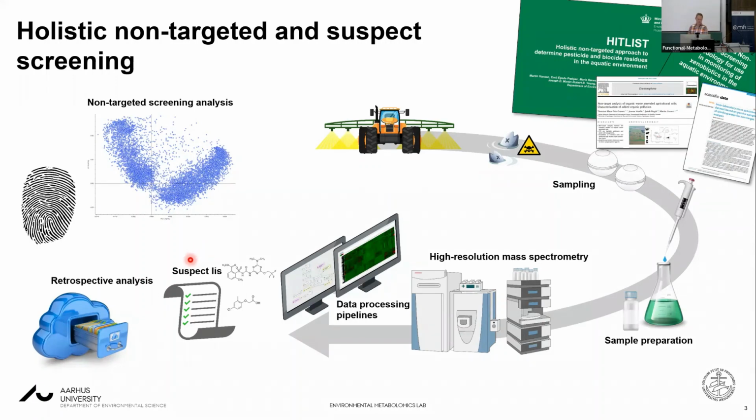We could also have a shopping list. This is typically in environmental chemistry, we call that a suspects list. If authorities are approaching us and ask, is that substance in this environmental sample, then we will just try and pull this out of the data. And then we could, of course, archive the data, as we talked about this morning, and then you could revisit it.